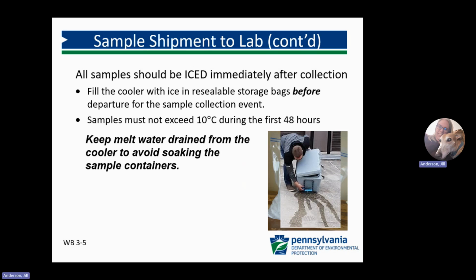All samples should be iced immediately after collection. This is very important. Fill the cooler with wet ice, preferably in resealable storage bags, before your departure for the sample collection event. Samples must be chilled during shipment and must not exceed 10 degrees C during the first 48 hours after collection. And ideally, you'll want to keep any meltwater from melted ice drained from the cooler to avoid soaking the sample containers.